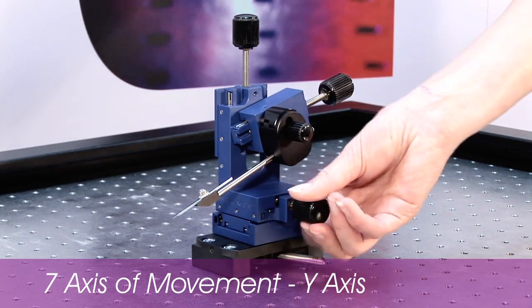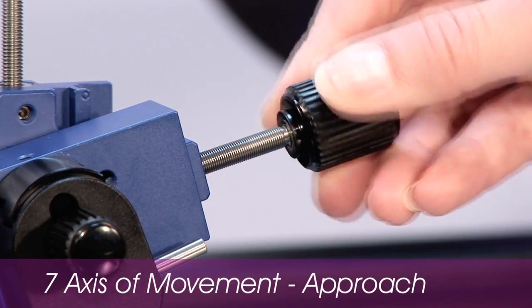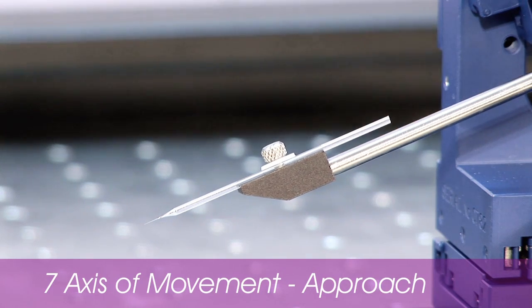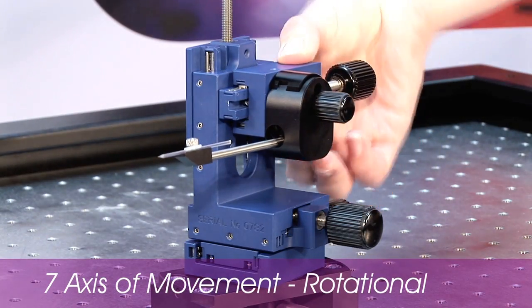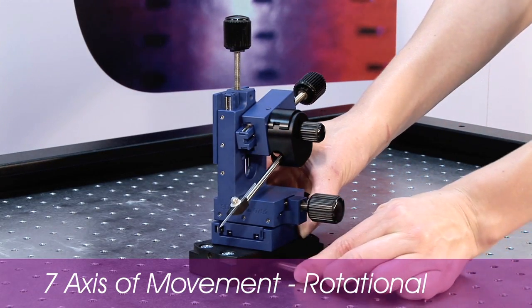High quality pre-stressed linear ball bearing stages with 25 millimetres of travel, and 12.7 millimetres in the y-axis, guarantee consistent performance and reliability. The rotational adjustments optimise pipette working angles and ensure quick and easy pipette exchange.